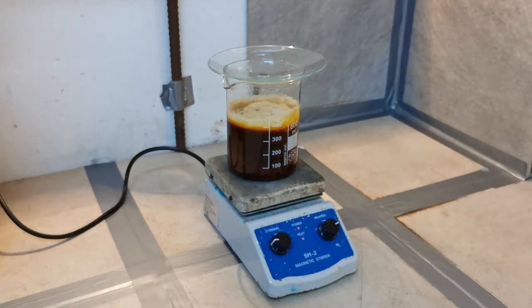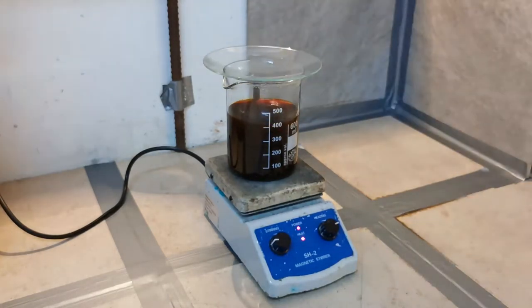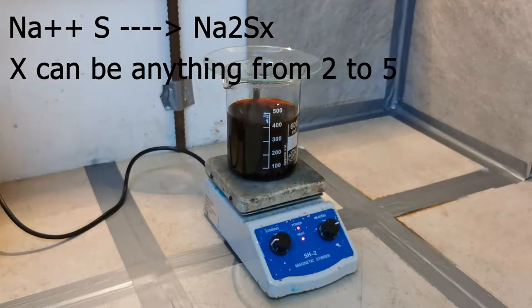To get started, I prepared a solution of sodium polysulfide. In theory, any polysulfide can be used. Depending on whether sodium hydroxide or sulfur is more valuable to you, the mass ratio can range anywhere from 1 part sodium hydroxide to 0.8 up to 2 parts of sulfur.